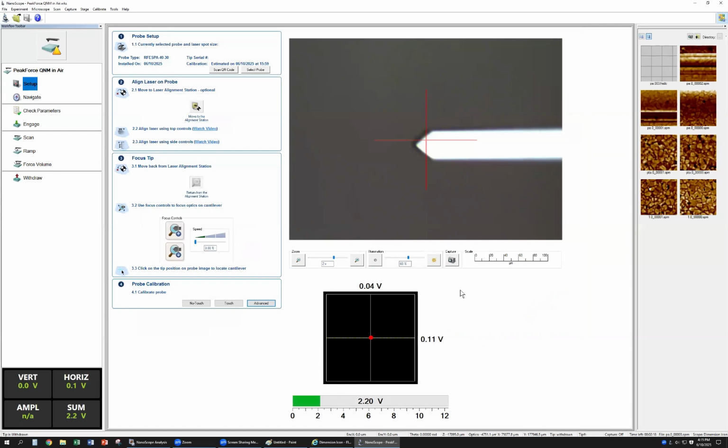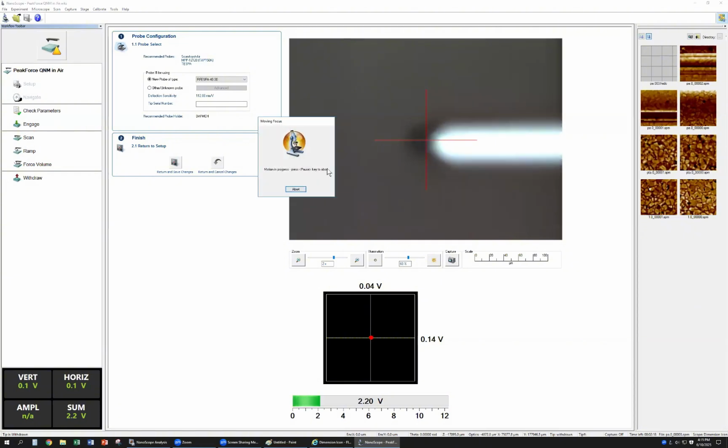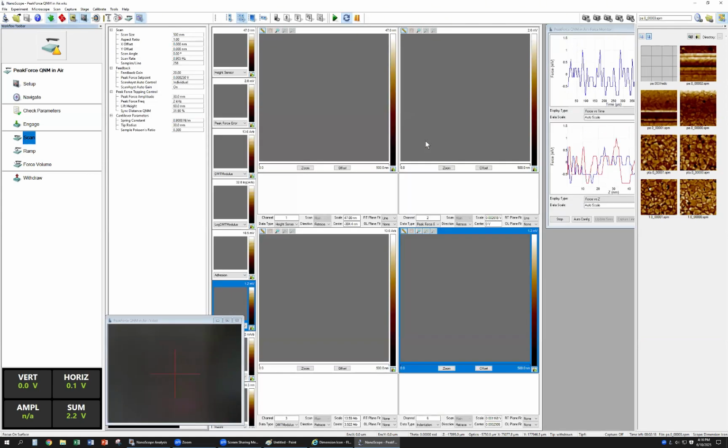Then from here, we already know the deflection sensitivity, K and R, right? All these three. So if you just want to see the data in contrast, you do not need to be really accurate with the data. For the deflection sensitivity, you can use this data. Then K, this is key data. For K you can just use the value on the box. For example, this one on the box they call 0.9. Then this R, we don't know this R.